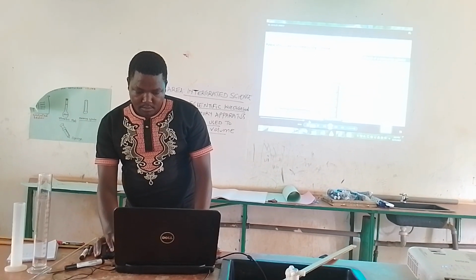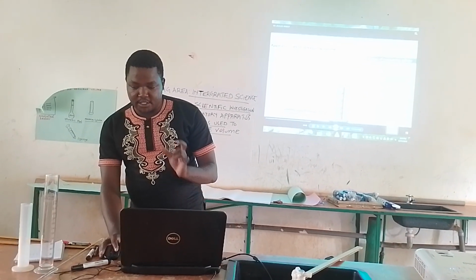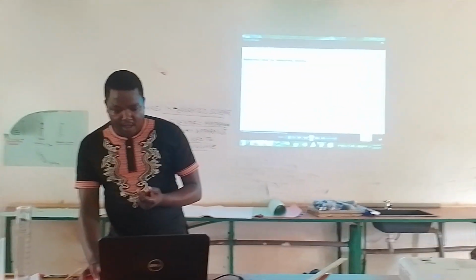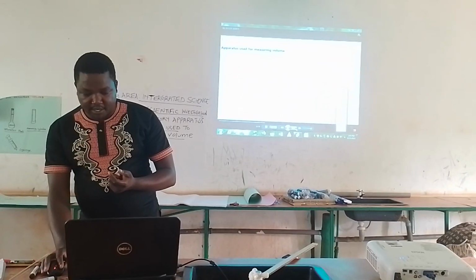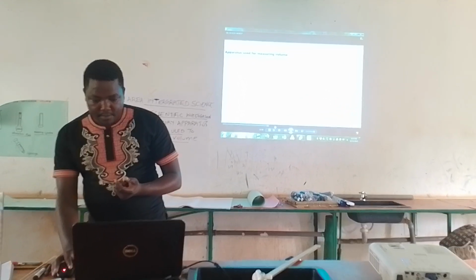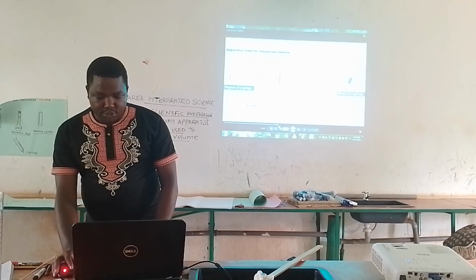It all depends on the amount of volume. I'm not interested in the points. I just want you to see the photographs or the diagrams of the apparatus used to measure volume. You can even close the volume. That is a syringe.